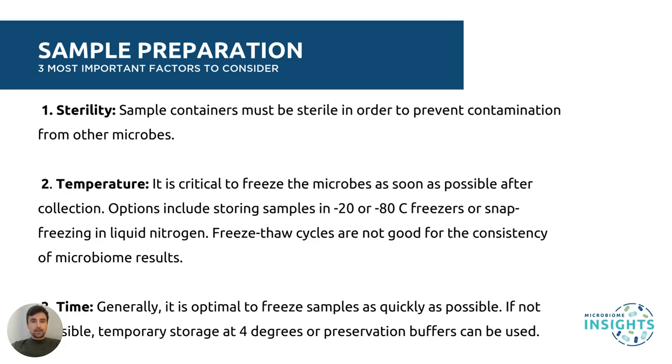Timing is also key. If you can't freeze samples immediately, temporary storage at 4 degrees Celsius is acceptable for most sample types, but freezing is always preferable to maintain the integrity of the DNA. If you can't access freezers quickly, a range of preservation buffers can help to preserve microbial DNA for days or even weeks. These steps will ensure that your samples remain intact and uncontaminated, giving you the best chance at high quality sequencing results.